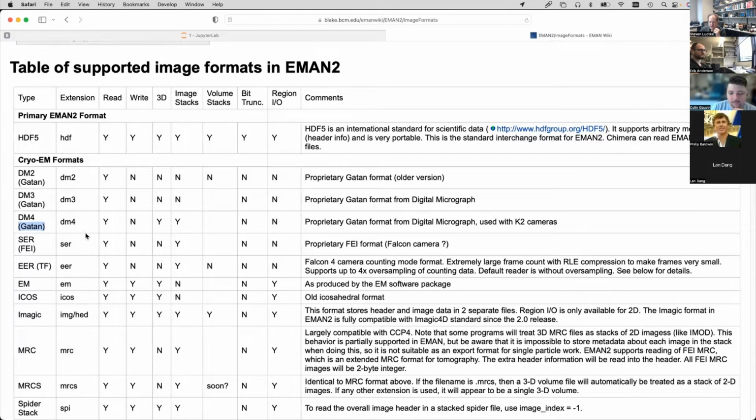The reason they don't make it public is just a practical reason, not a legal reason. So they're not averse to people knowing. They just don't want to feel responsible.